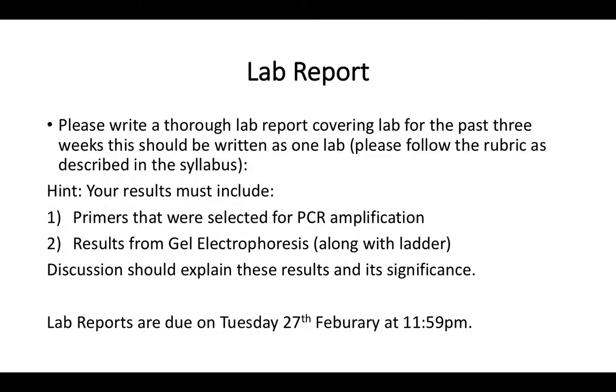So the lab report will include what we've covered within the past 3 weeks. So from the primer design worksheet, next to the actual PCR or polymerase chain reaction, to gel electrophoresis. So the class has to write a thorough lab report that covers the past 3 weeks of labs, of course. And I would like you to follow the rubric as is described in the syllabus. And here's a little hint. The primers have to be part of your results. Just the 2 primers that you selected will be part of the results.